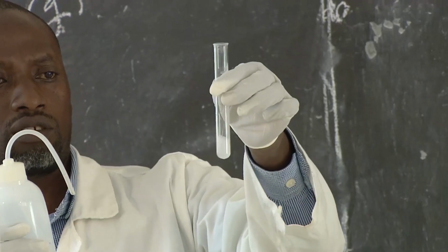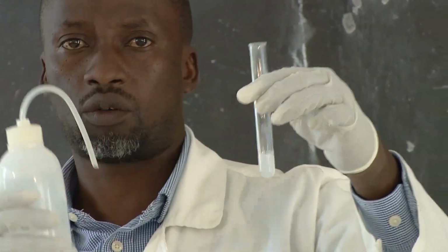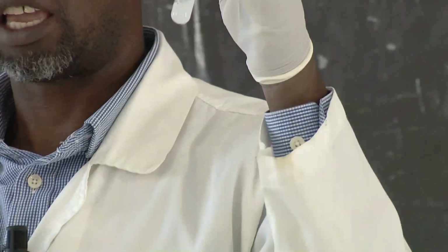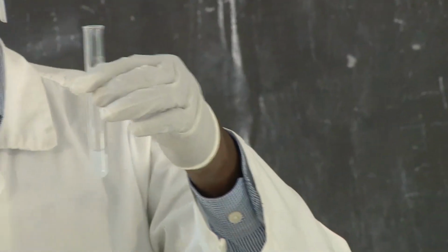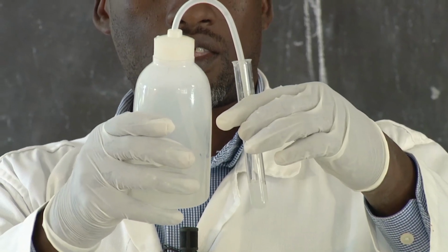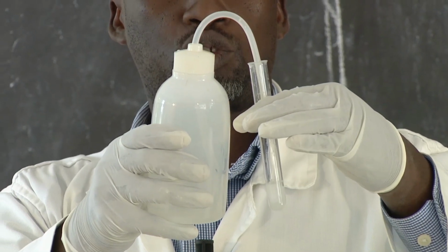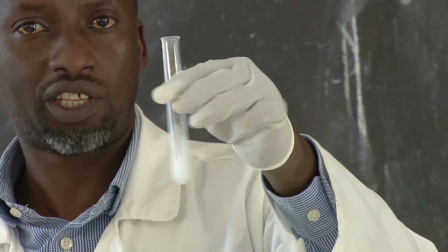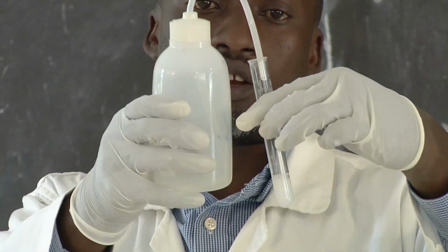See what happens? That is a precipitate. When we talk about the precipitate, it is a solid. Precipitates are in the form of solids, so the solid is formed. And it is important to identify the color of the precipitate. So this is a white precipitate. You can just take a look at it.